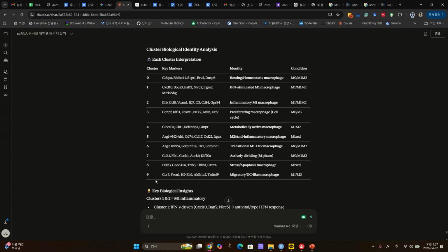Okay, I have to make fewer clusters, like 4 or 6. So based on that, you can just ask them and try to tune this.